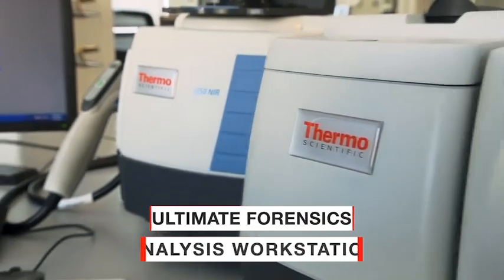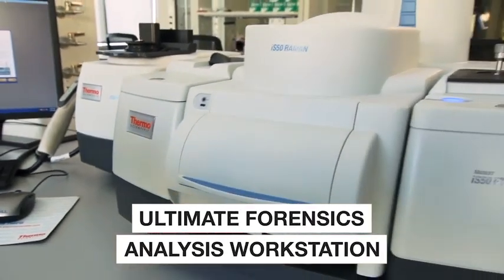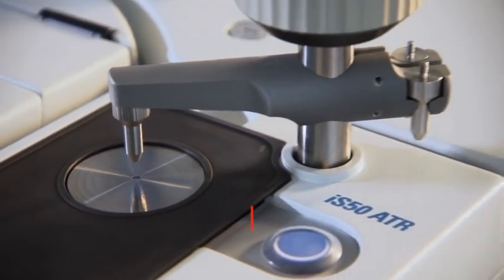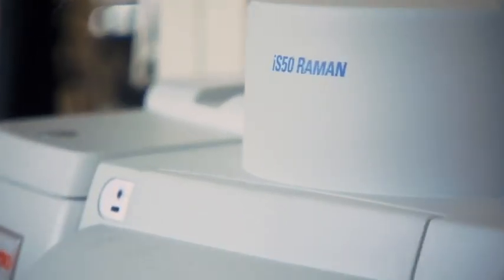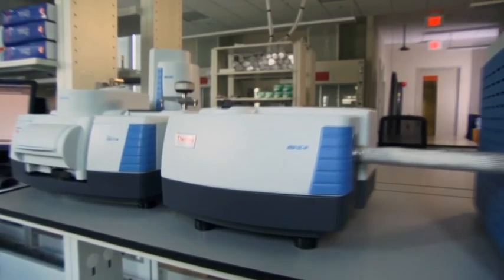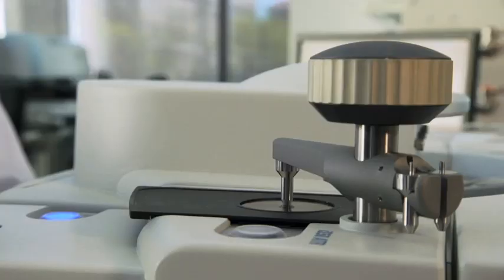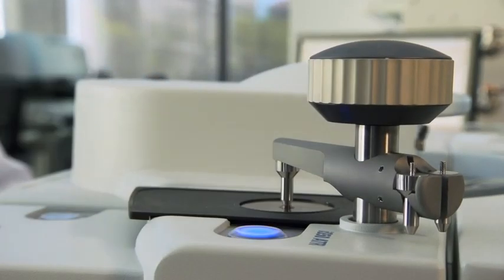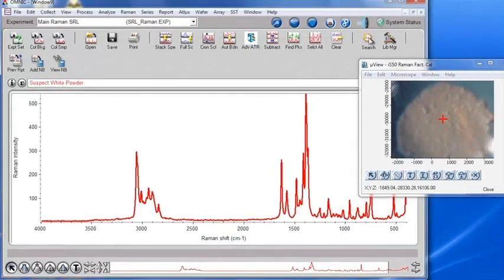The ultimate forensics analysis workstation, with integrated ATR, multi-range sampling, automated beam splitter exchange, coupled with chromatography, always ready for use, and exclusive Omnic software that removes subjectivity from your work.